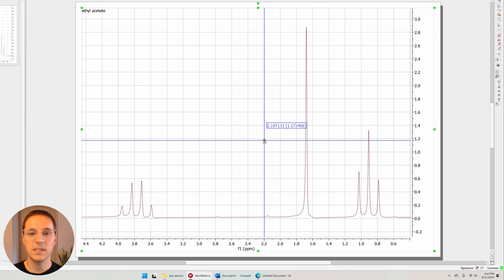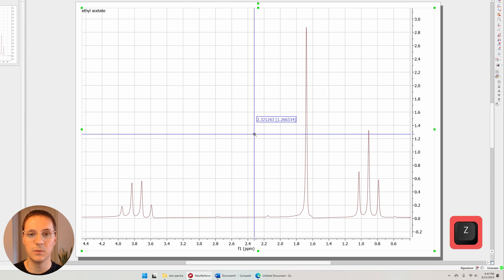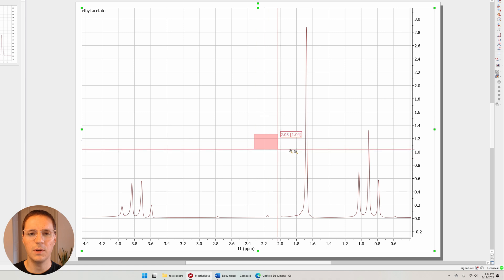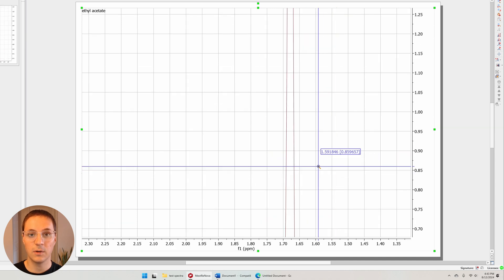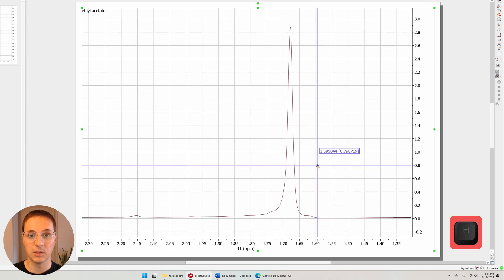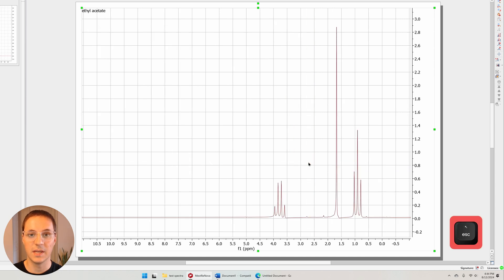Pressing Z twice or thrice enters you into the vertical or region zoom tools. Avoid using these. If you can no longer see your spectrum, press H and F to zoom all the way out. Press escape to exit whatever tool is selected.